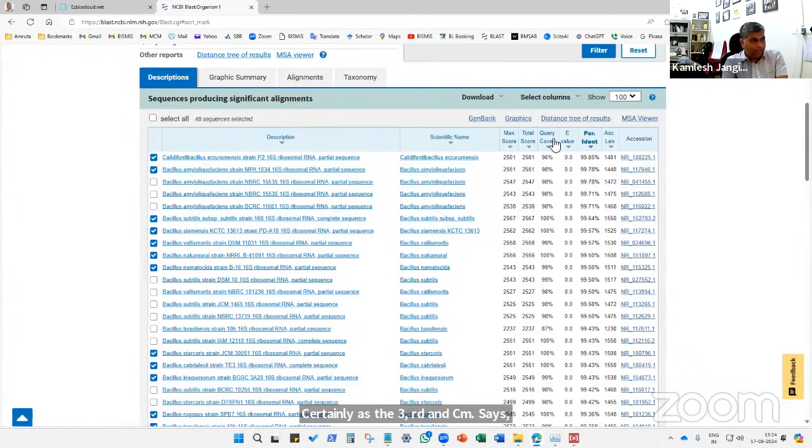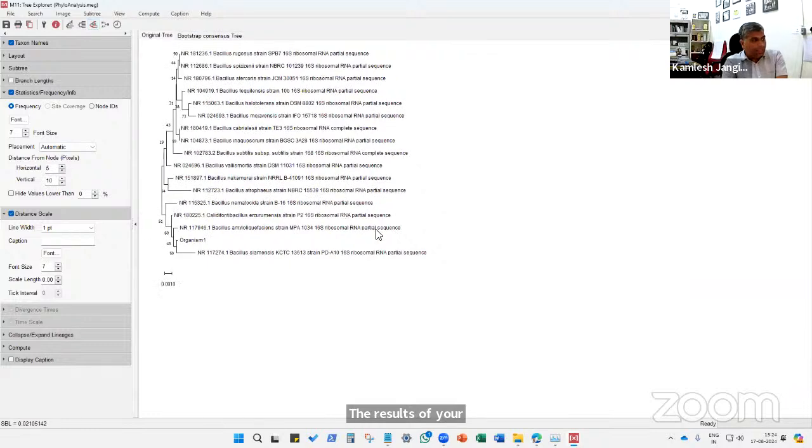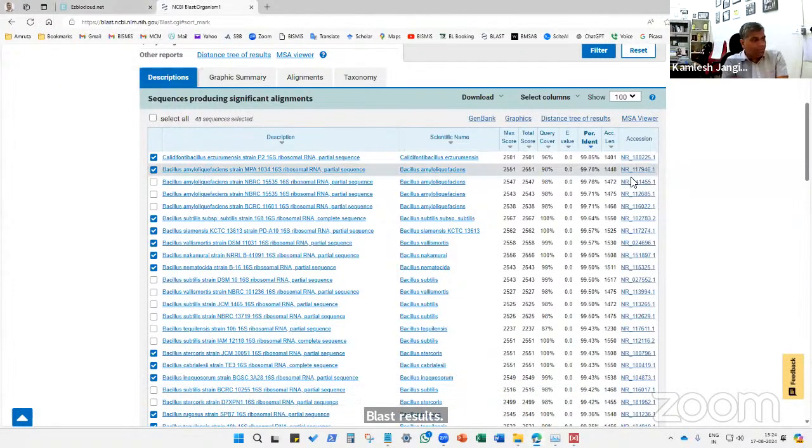All right. So as you see, the results of your phylogenetic analysis and the results of your BLAST results vary drastically. They will differ many a times and in most cases.